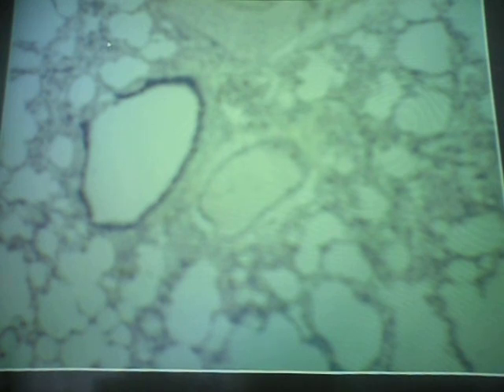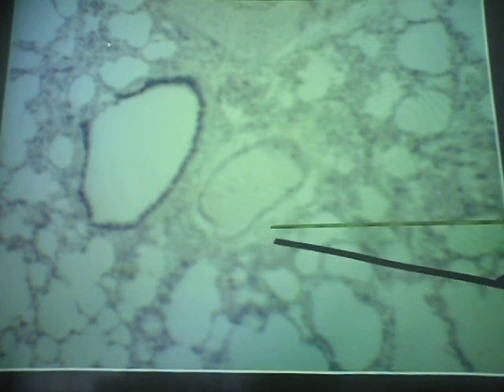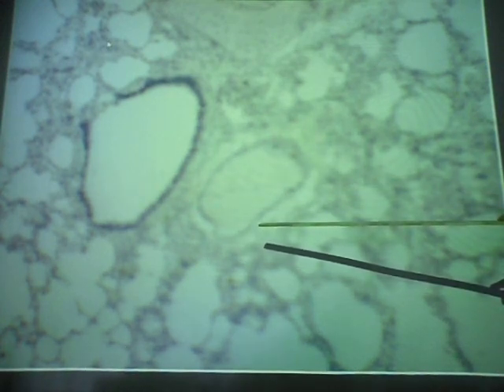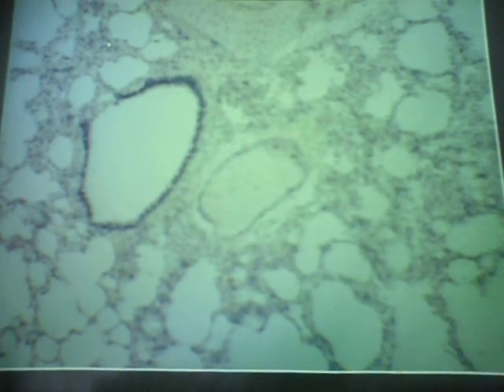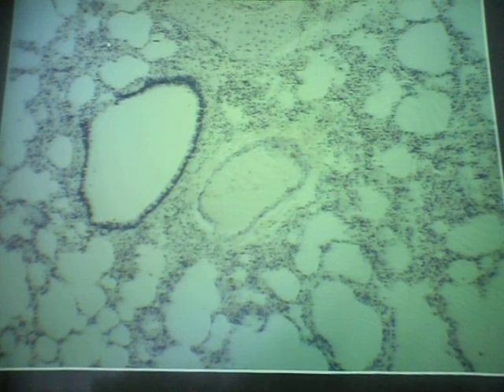And that's where we were before. What kind of respiratory passageway is this one? The dark one, the big dark one? Yep, this one right here. What is it? A respiratory bronchiole? Yes, very good. No cartilage in the wall.